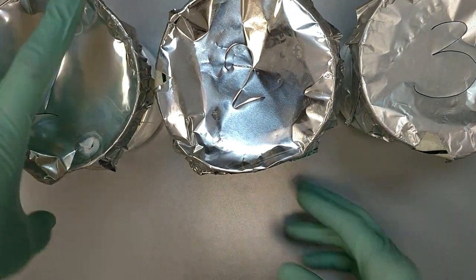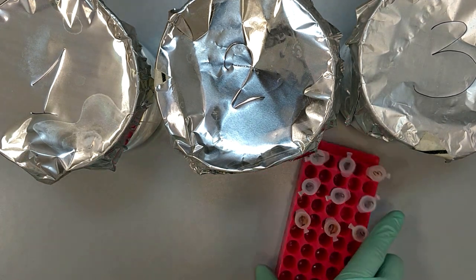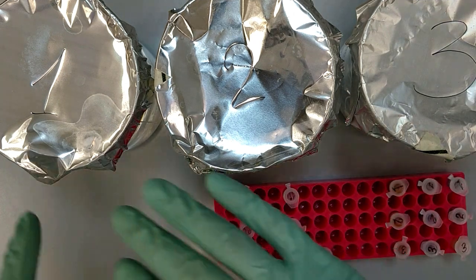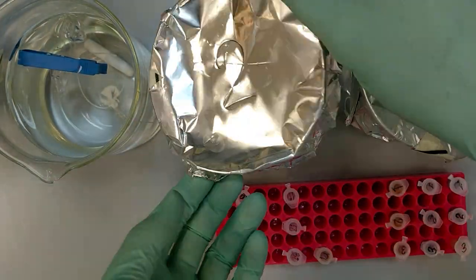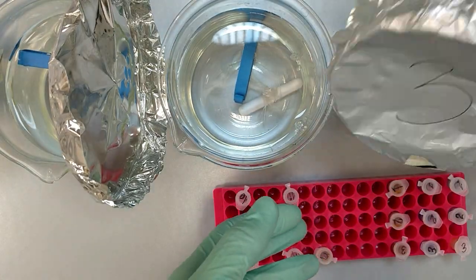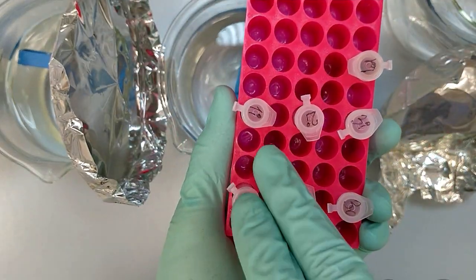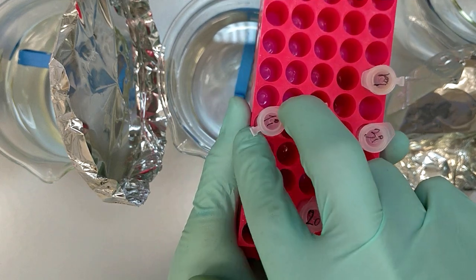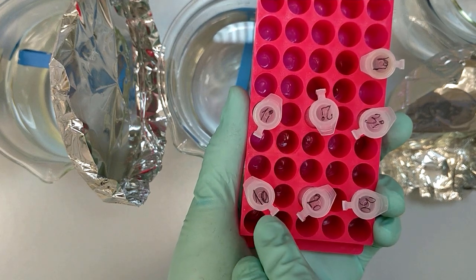So you can see first, second, and third secret solutions. And for testing of these solutions, we will need to collect the liquid outside and inside of these semipermeable membranes. So we prepared the Eppendorfs with sign I and sign O on it, so inside and outside.